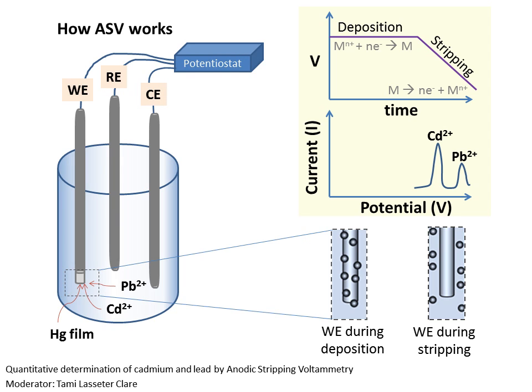One thing you should be aware of when you take the cell apart is that there is a tendency to want to invert the top part of the cell where the electrodes are, so as to put it down. But if any liquid gets poured out of the electrodes and into the stir motor, that could damage the cell. Please try to resist the temptation to put that piece down. You'll just have to hold on to the top part of the cell with one hand while you swap out the sample cup with the other hand, or ask your partner to help position the sample cup while you hold the top part containing the electrodes.